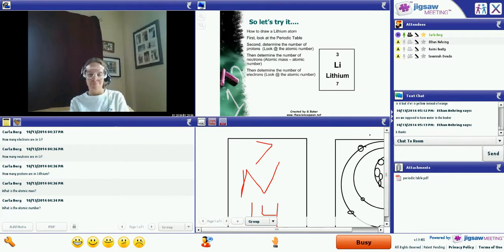You know that because there was only one drop. So it limited the equation. It limited the reaction. What was the excess reactant in wells D1 and D12? In well D1, the excess reactant was copper nitrate, and in D12, it was calcium nitrate.